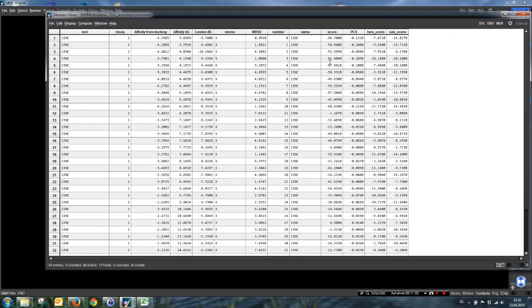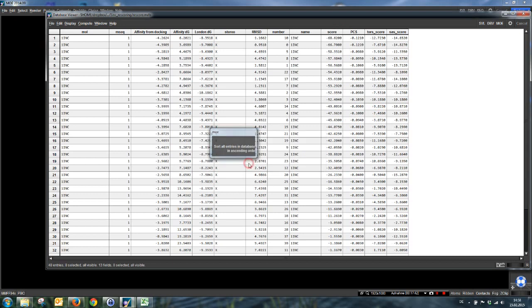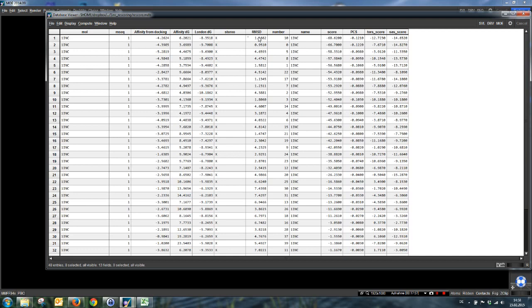Now you see we have the DSX scores in our rescore database. Now we can sort by the DSX score. And you see in this case the affinityDG scoring function was even better. But we have two very nice near native poses. We say below two angstroms this is called near native. So with affinityDG and with DSX we get very good results in this example. But in total when I have to say which one to rely on, when I don't know exactly which is the near native pose, I would rely on the DSX score for pose prediction.